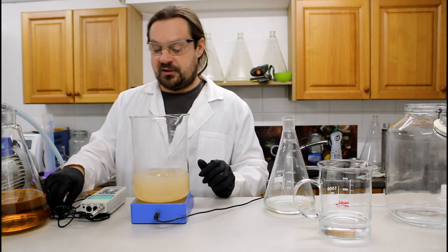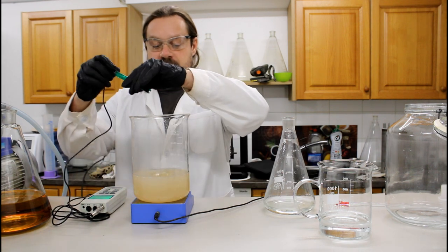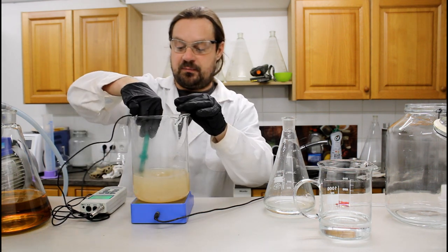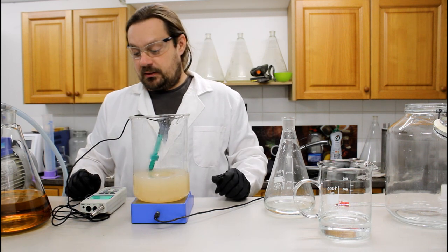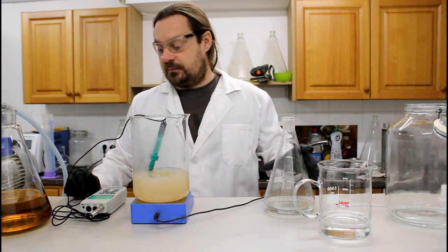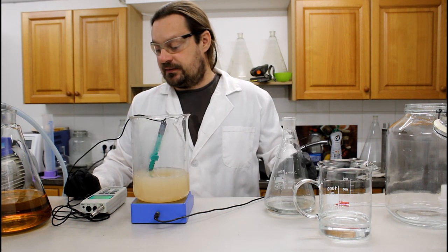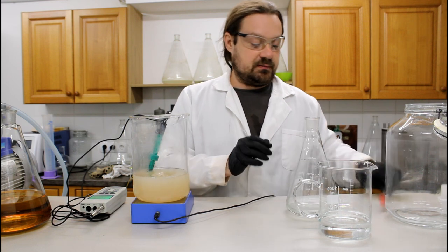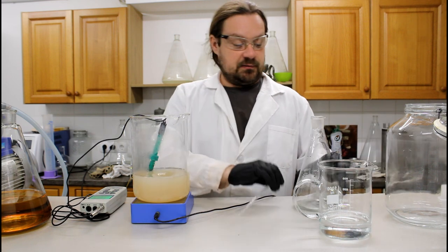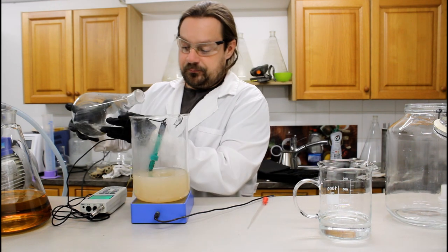Okay, the first precipitate forms. So we are checking the pH. Probably still high. Yeah, we are still at pH 11.08, so we need, we can use that.